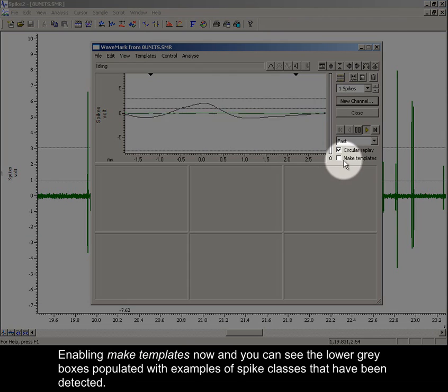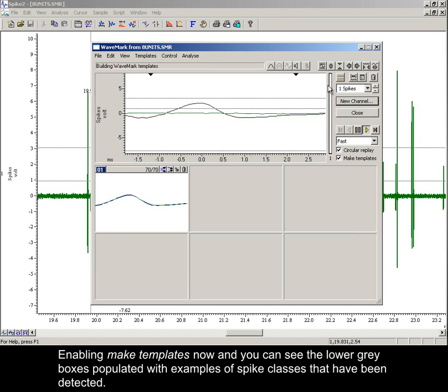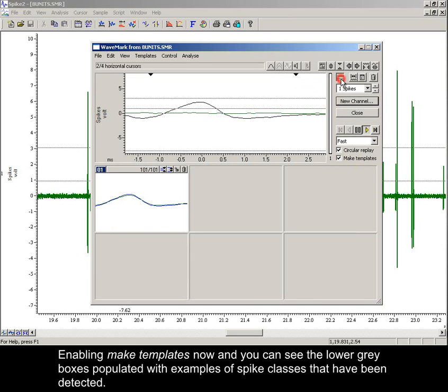Enabling make templates now, you can see the lower grey boxes populated with examples of spike classes that have been detected.